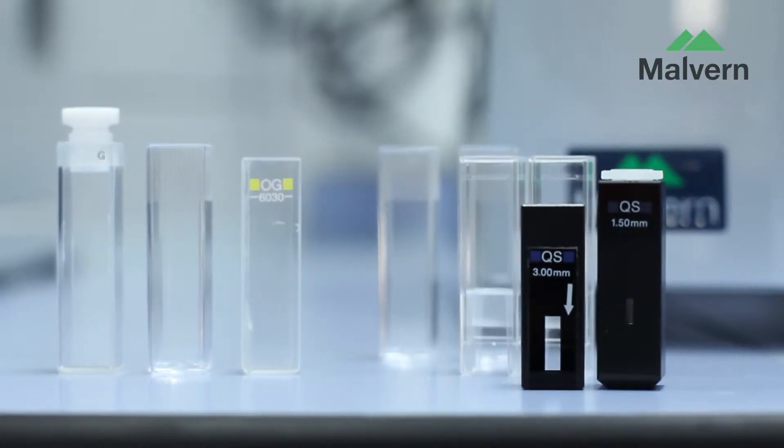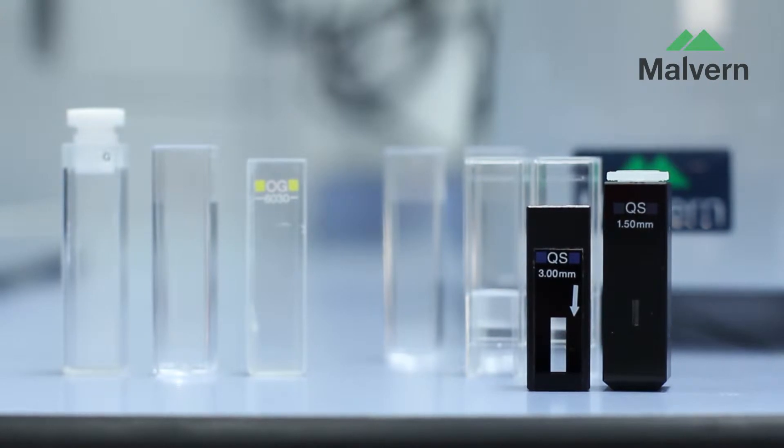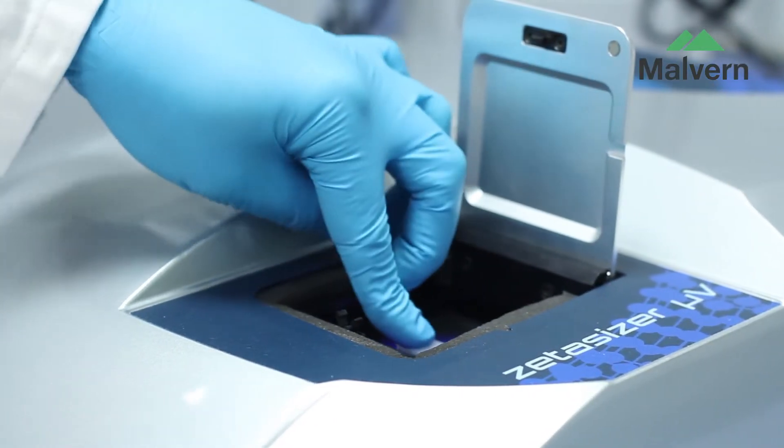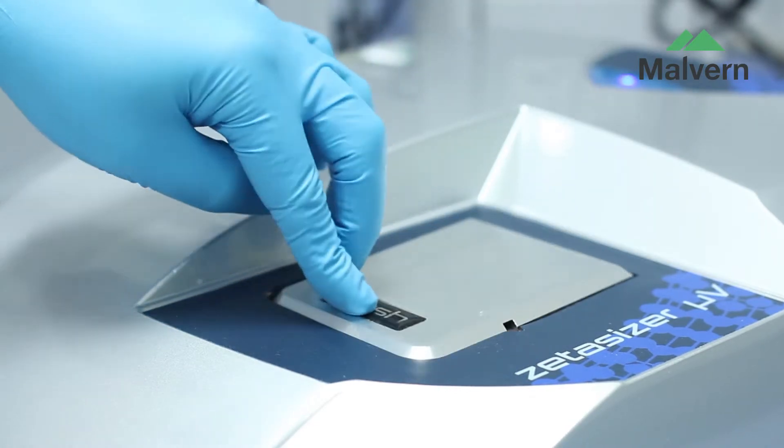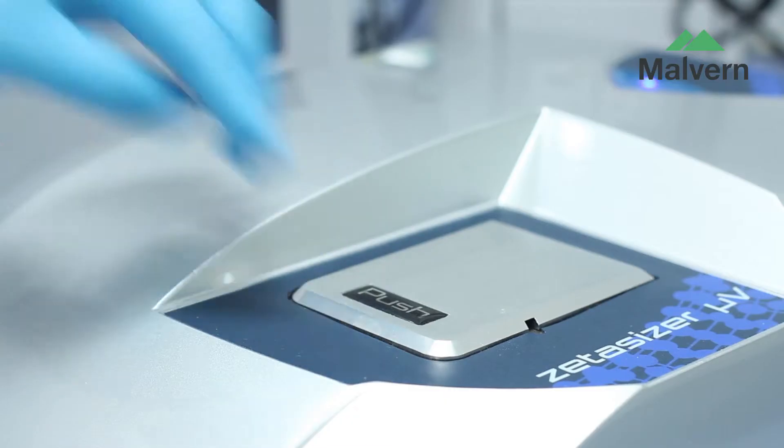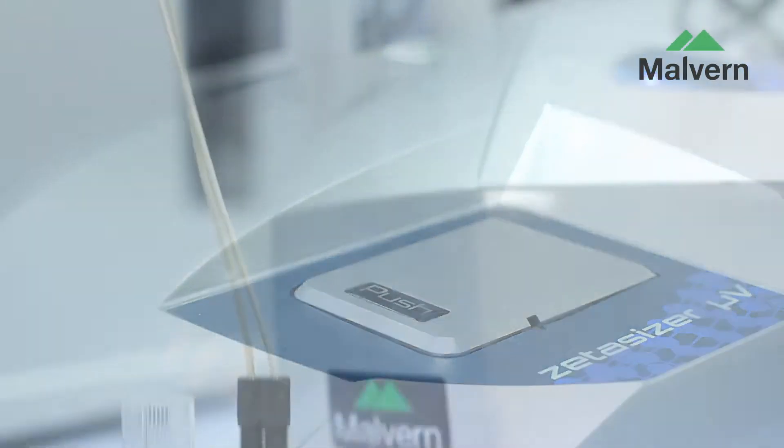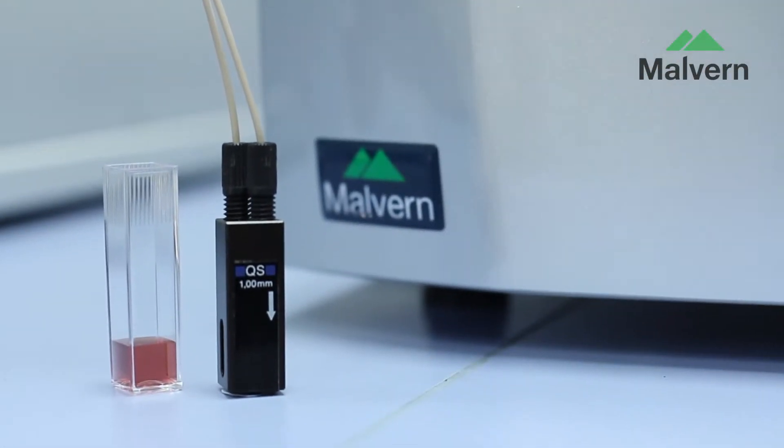For batch DLS, many cuvette types can be used in the Zetasizer Micro V, giving you flexibility over how to analyze your sample from large and small volume disposable cuvettes to high-quality quartz cells down to just 2 microliters.